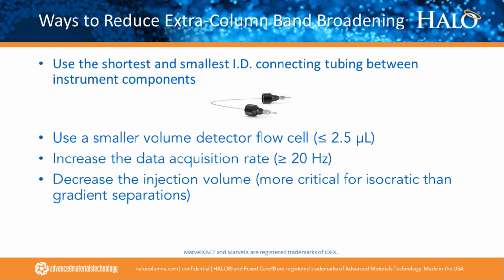You can also increase the data acquisition rate. Our recommendation is greater than or equal to 20 hertz. You can also decrease the injection volume, and this is more critical for isocratic than gradient separations.